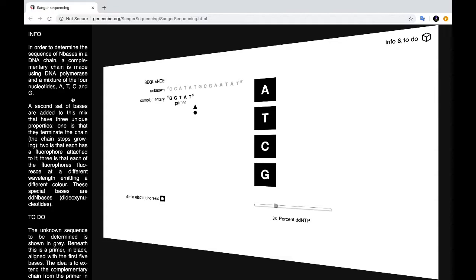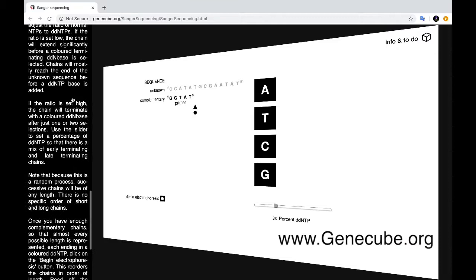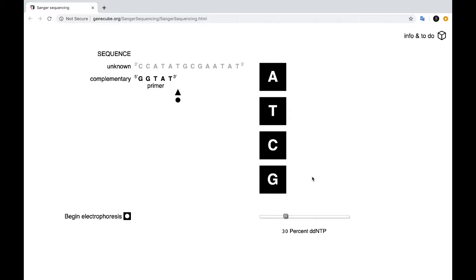So we can simulate Sanger sequencing using genecube.org. If you go to this site, you will find that there is a set of instructions down the side to indicate how to use the simulator. At the top, you will see the unknown DNA sequence. And this is the sequence we're trying to determine using the normal deoxyribonucleotides and the DDNTPs.